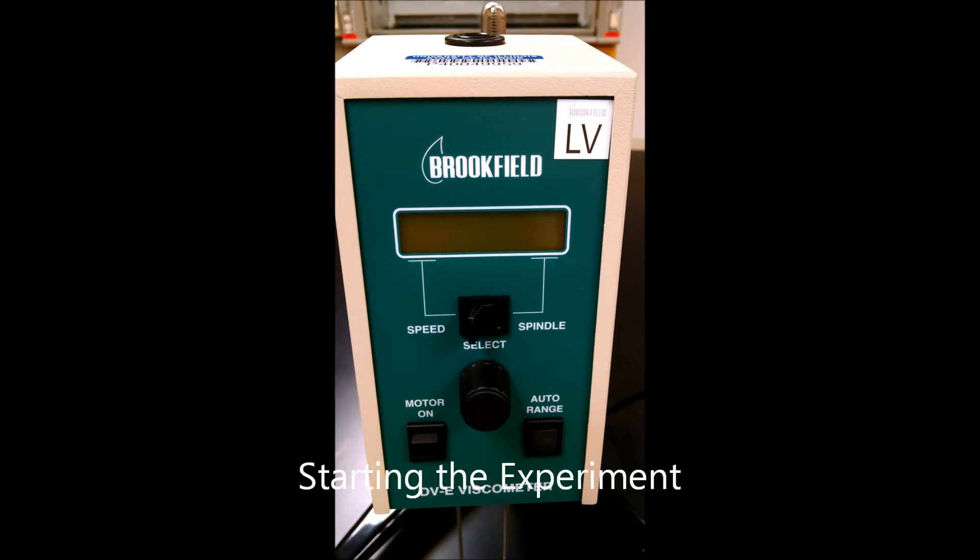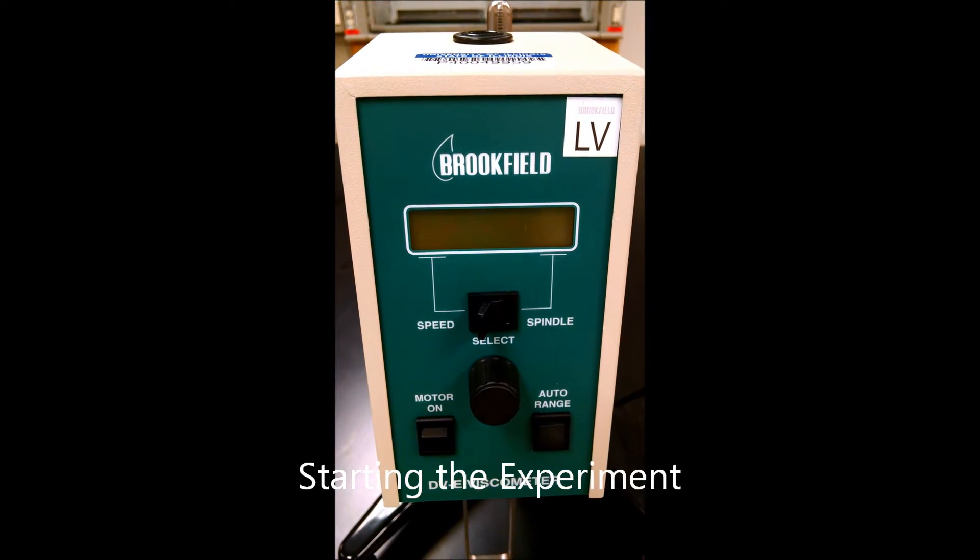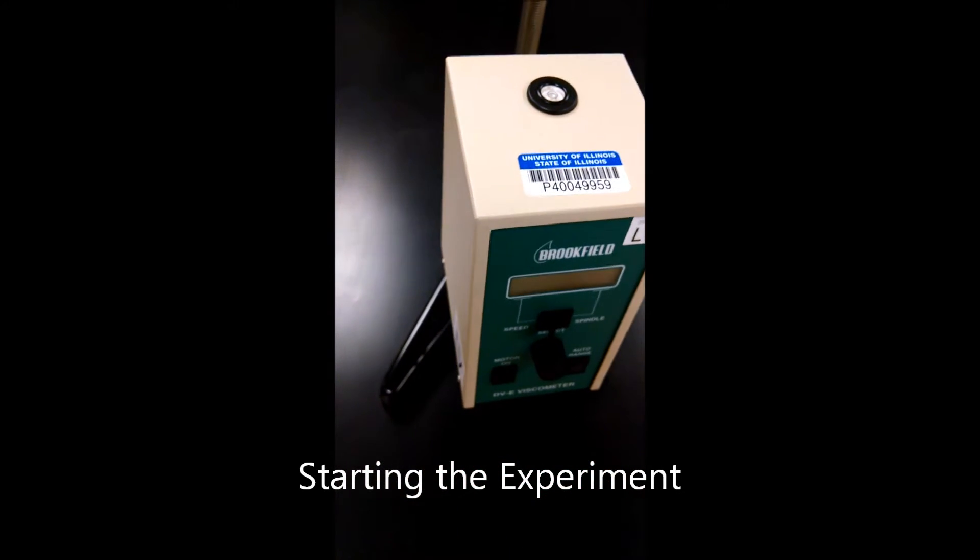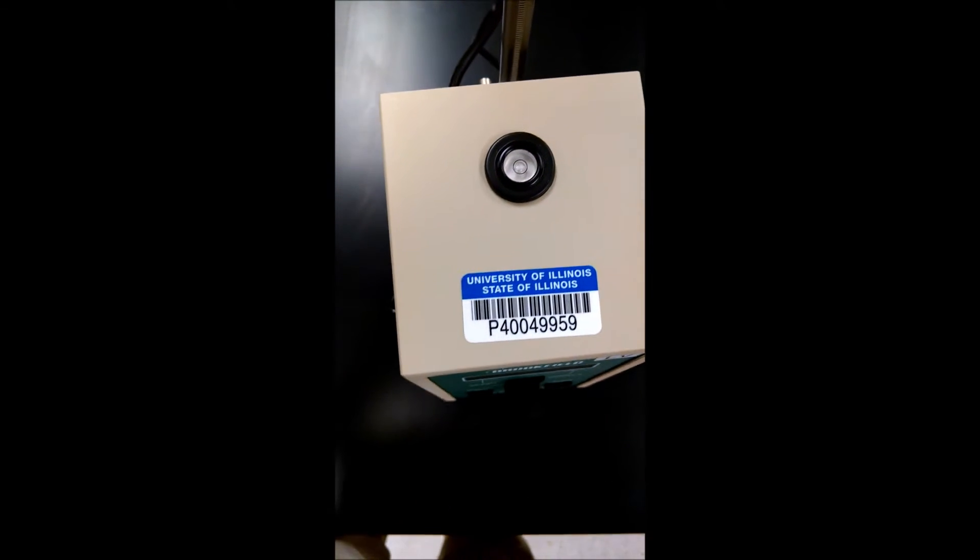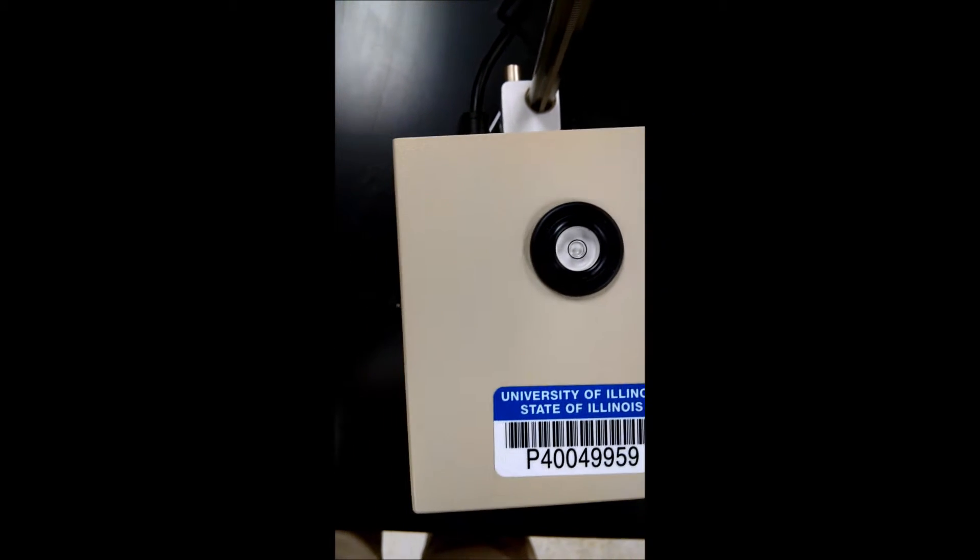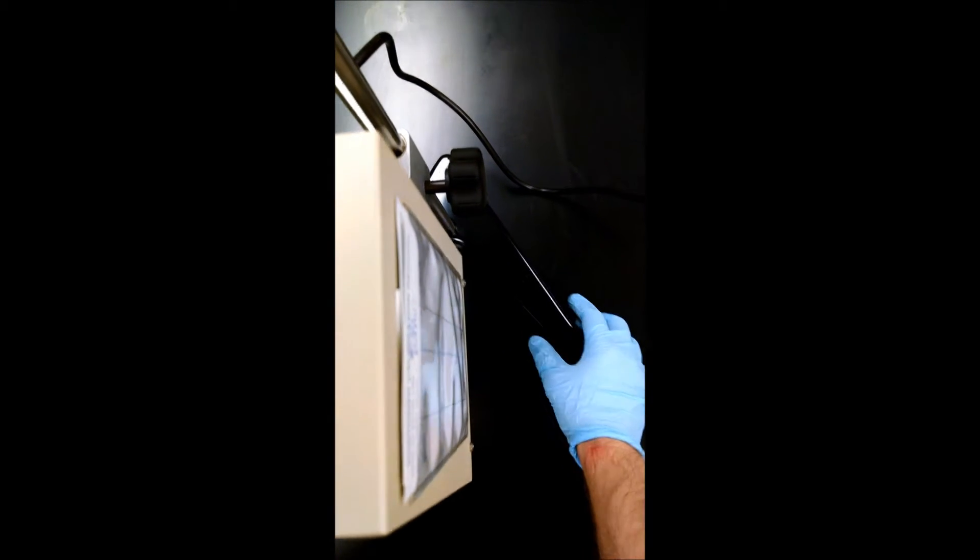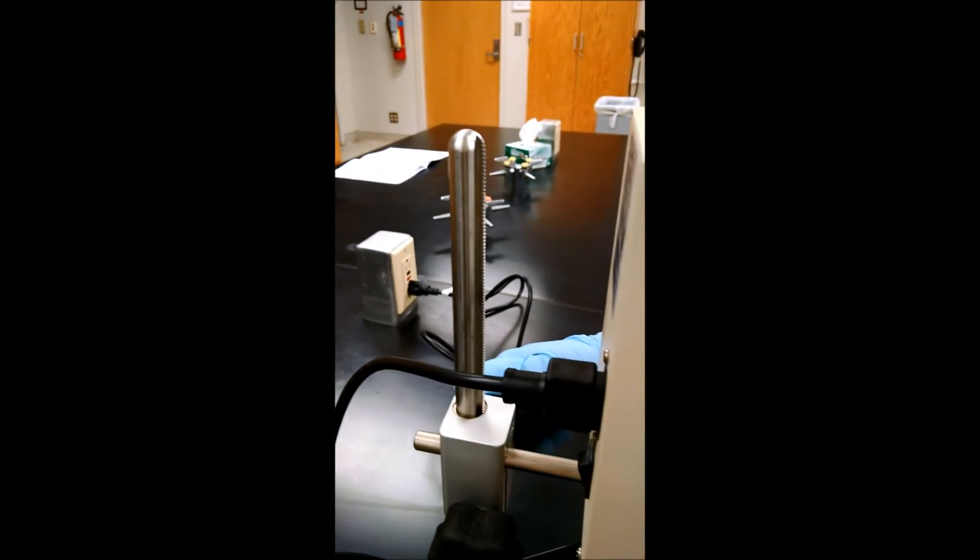In this video we'll show you how to use the Brookfield DVE Viscometer. The first thing you need to do is make sure that it is level using the leveling bubble window at the top. To adjust it to level, use the screw knobs at the base of the stand.